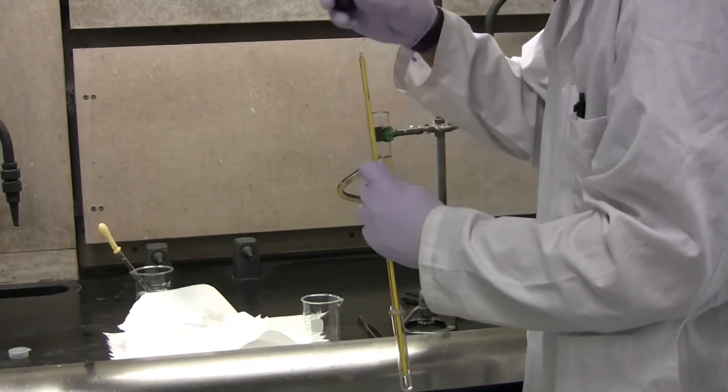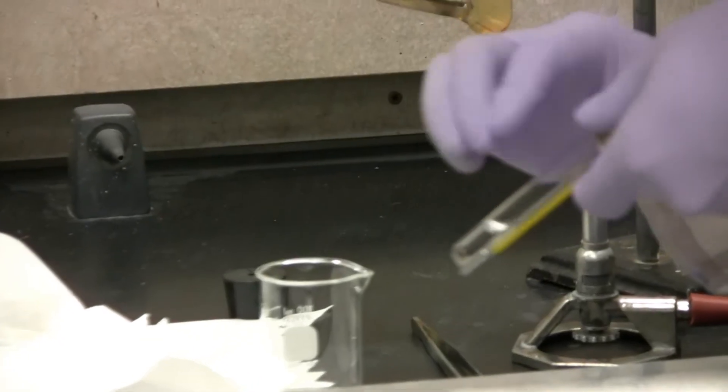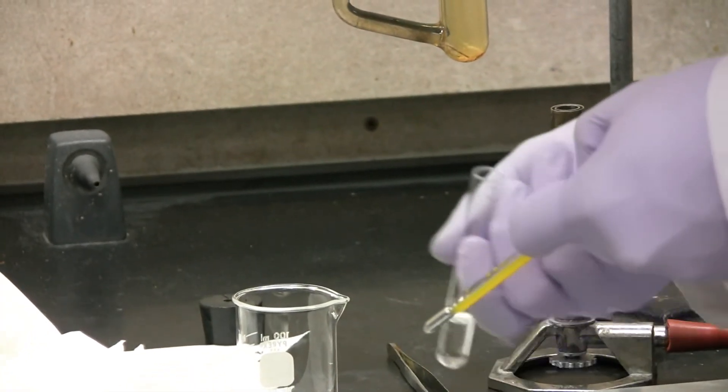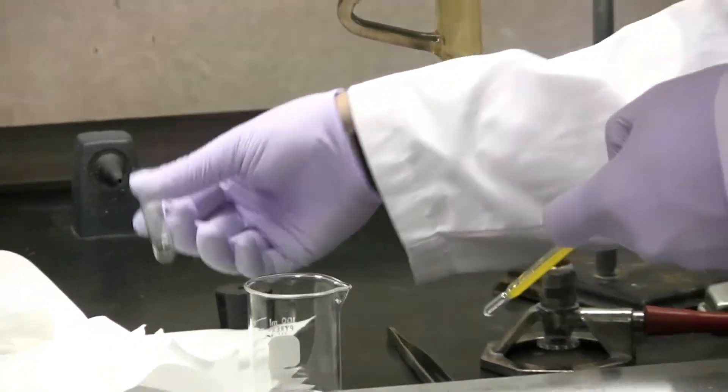Next, your sample in the test tube will need to be removed without spilling and deposited into a waste beaker. The rubber band will be removed.